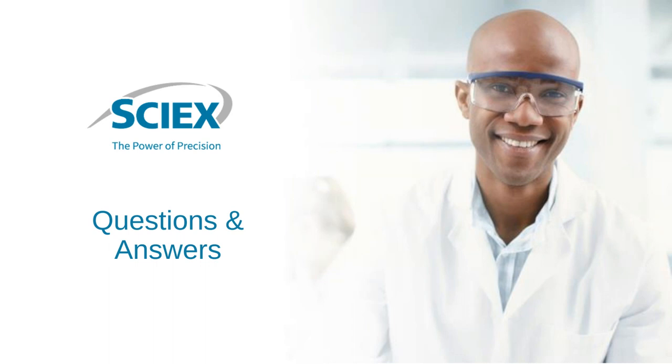Let's get started. Our first question is, what cartridge options are available? Can you build your own cartridge?